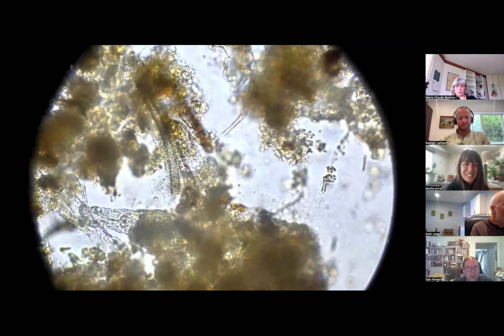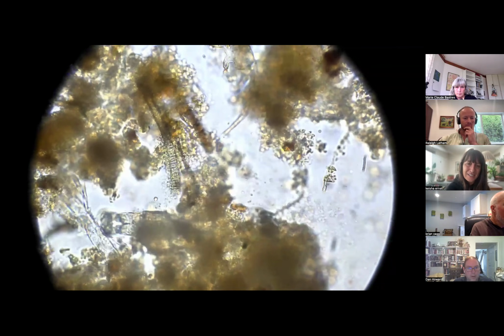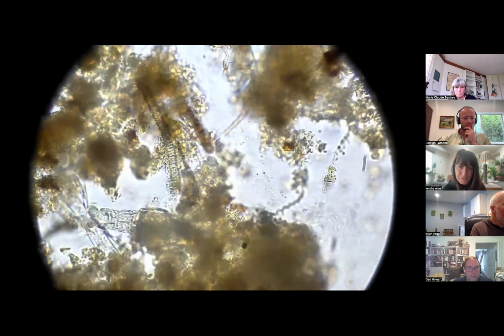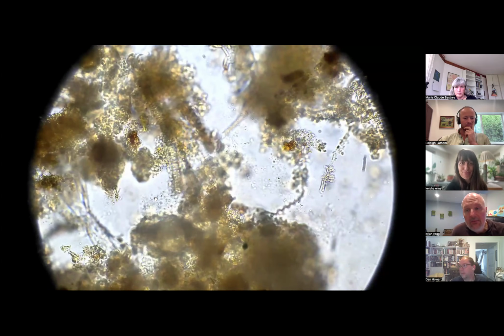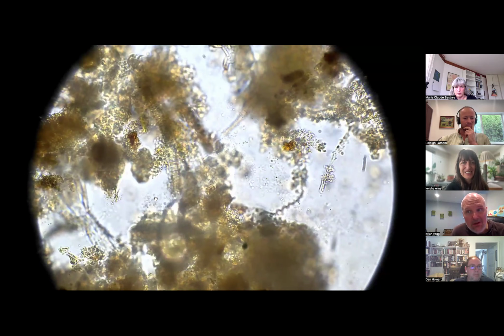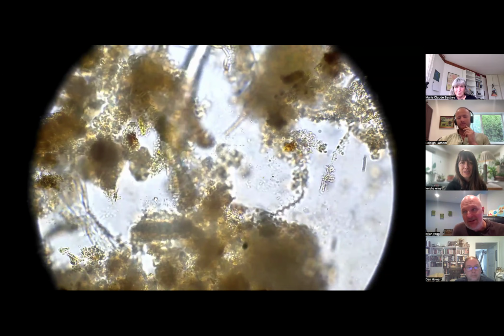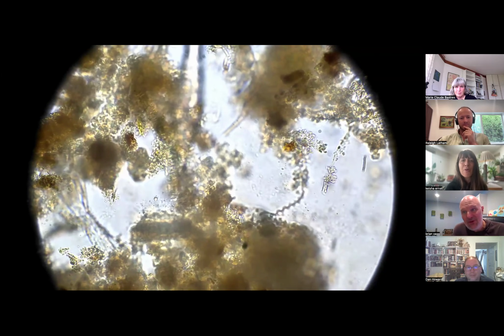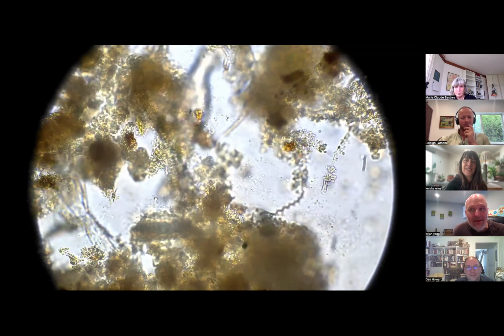I don't see a lot of bacillus. Are you seeing it on your side, Brian? There's some, but not a lot. There was more earlier. It's been about an hour now since I added oxygen. The biggest thing was the spirilla. Oh my gosh, they were just everywhere. And again, here's another rotifer. In an hour, the entire bacterial ecosystem has changed. Wild.